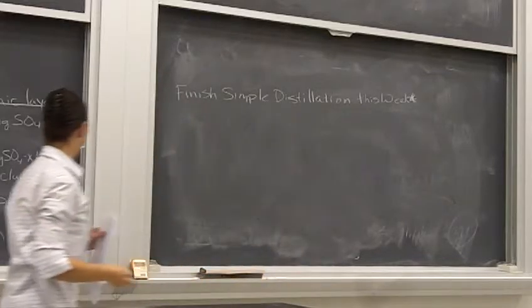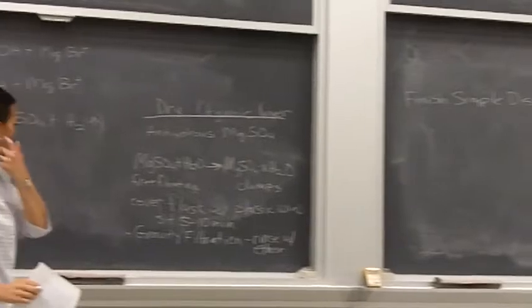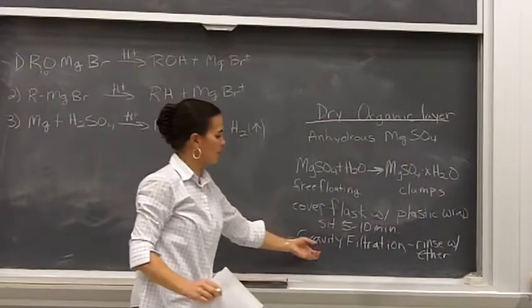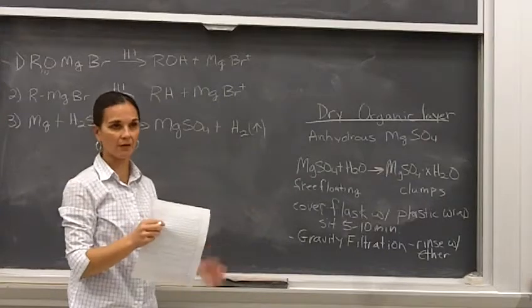Into that simple distillation this week. Now, while the simple distillation is going, we can let our filter paper with our magnesium sulfate air out in our hood for a little while, to get rid of that ether.